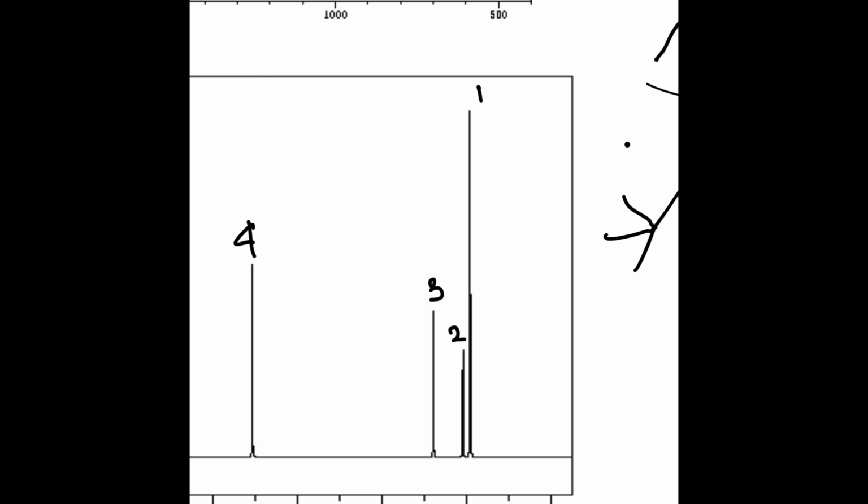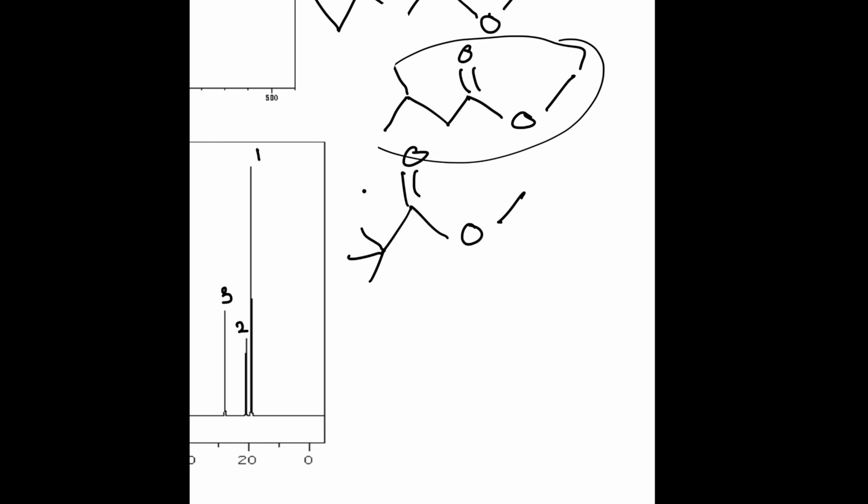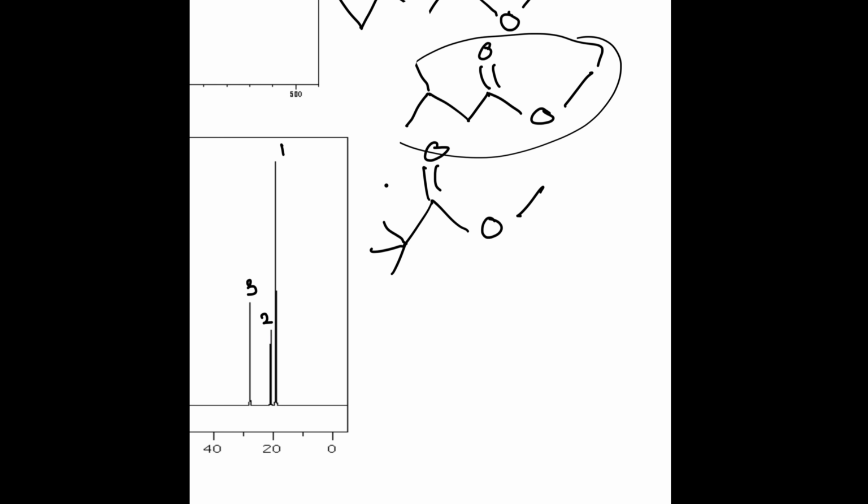We can determine by the peak size that it does represent more than 1 carbon atom. So when we look again at our predicted structure, which is the one we decided here in the middle, I'm going to redraw that structure as this.